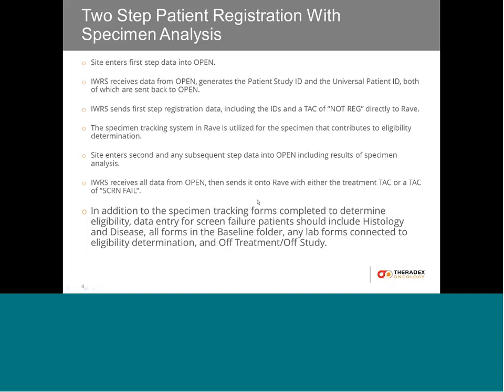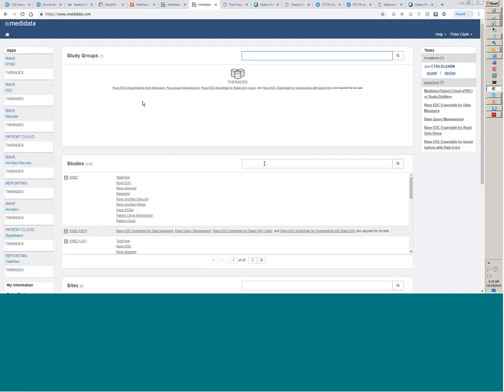This slide deck I will send to everybody on the call for reference. The rest of the slide deck includes a step-by-step rundown of the specimen tracking process that we're now going to go through. So I'm not going to go through the slides with all of the different text on it, but it will be a reference document for you. So now we're going to look in the RAVE environment.